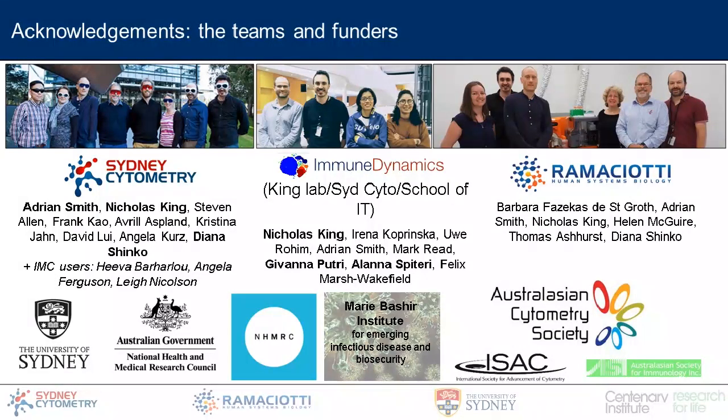So what we do with the encephalitis model is we can take a section of brain, we can stain it with a FITC conjugated antibody against, say, NS1, figure out what areas of the brain are infected on a microscope, take the same section, stain it with a metal conjugated antibody against FITC, and then image the areas we care about on IMC on the very same section. So we have directly comparable immunofluorescence images and IMC images of the same brain, which for us is very helpful.